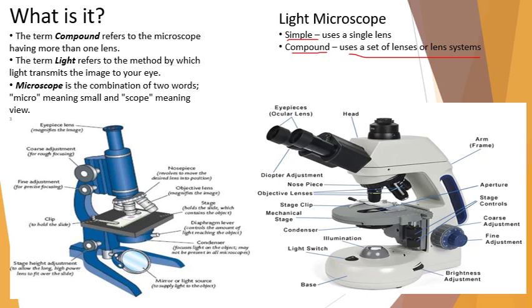Either way, the principle of both microscopes is the same. Here we have two microscopes, and they differ mainly in the source of light.